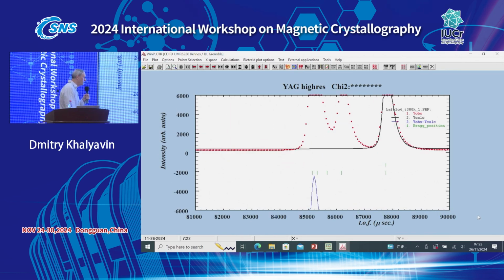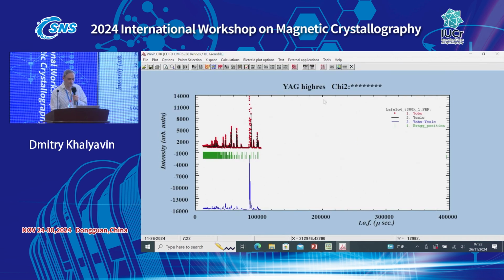we can index our peaks, our predicted peaks are at the right position. Okay, now we know the propagation vector, and we basically don't need to explore further. But you can do it yourself and verify that indeed this propagation vector is the only one which indexes our pattern.